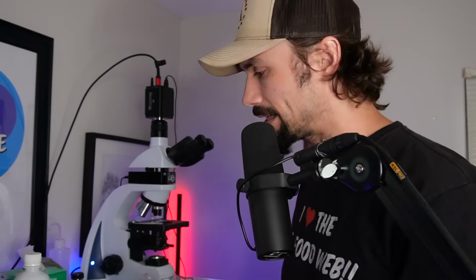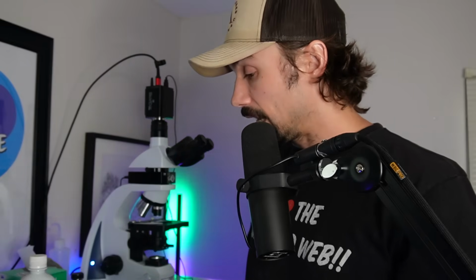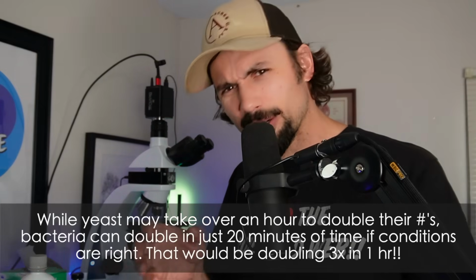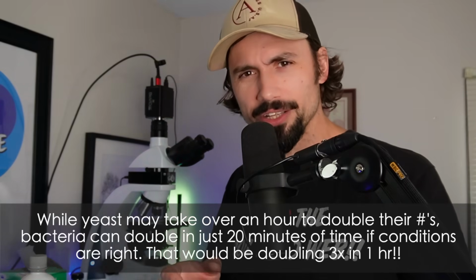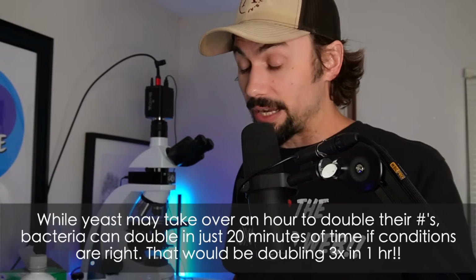So a lot of these things are super tiny when they're in a dormant state. And so when you're adding a sugar source, they're going to just multiply like crazy. So the exponential function, when you look at an exponential function in biology class in high school, remember? This is how I learned the exponential function.